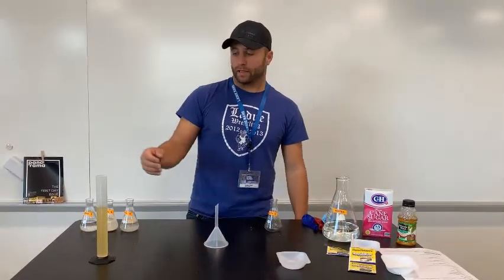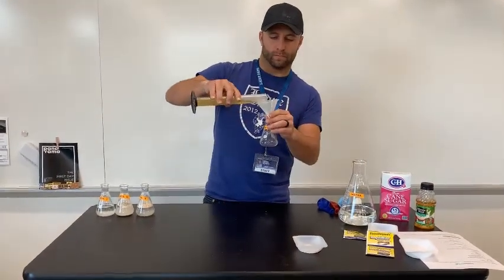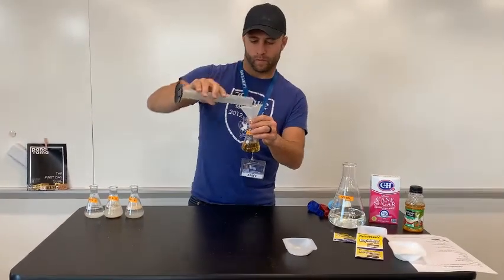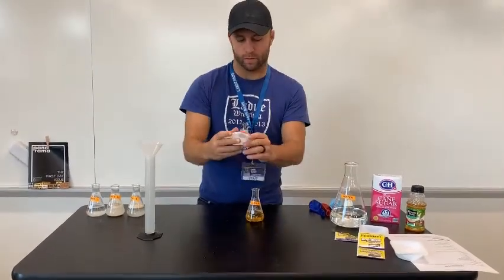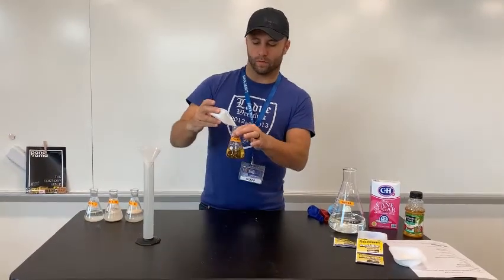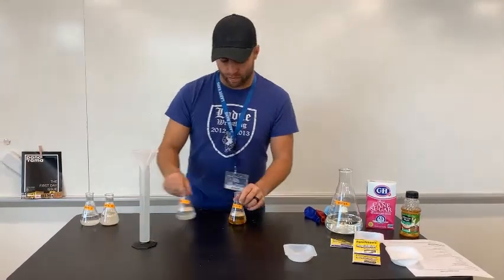Lastly, for flask four, we'll be adding 75 milliliters of apple juice, and then we'll be topping that off with a gram of yeast. And those are going to be our four flasks.